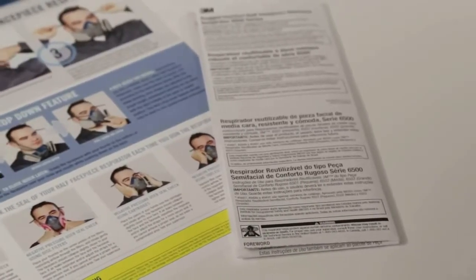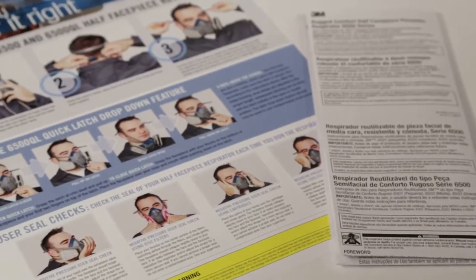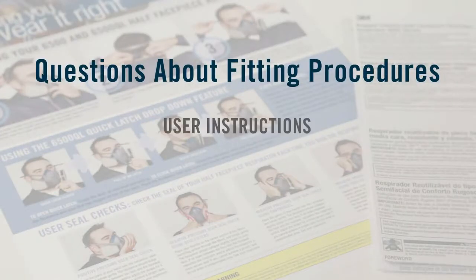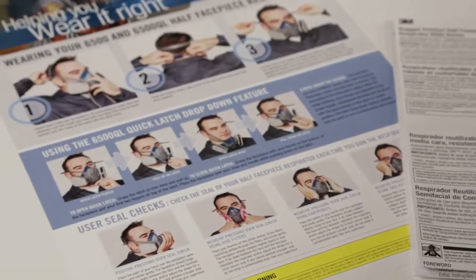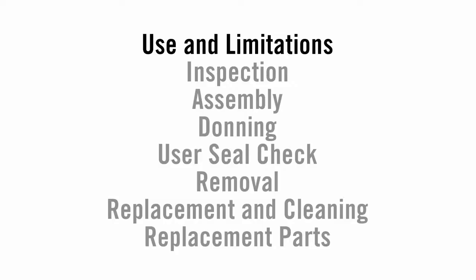If you still have questions about correct fitting procedures after viewing the appropriate segment for your respirator, review the information provided in the user instructions. Check the steps on the poster provided by 3M or see your supervisor. If you have questions regarding which respirator is right for your application, see your supervisor or trainer.